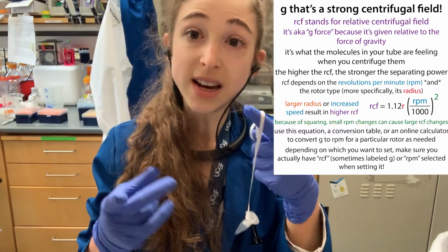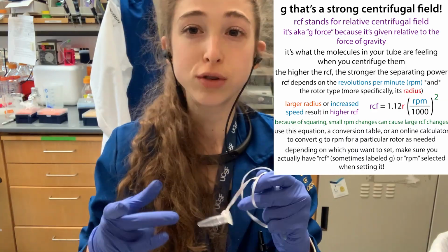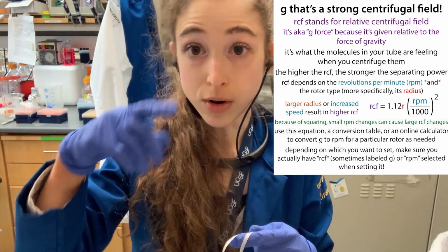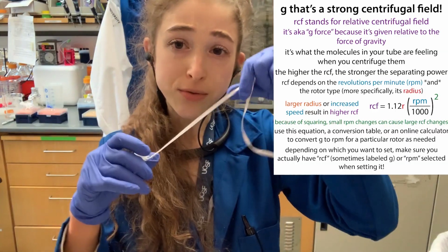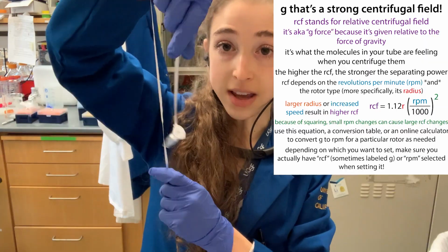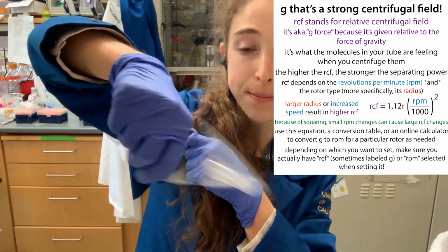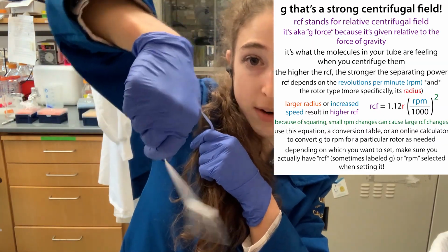We have to decide things when we're centrifuging, like how much force we want applied. How much force is going to be dictated by how fast the rotor is spinning, the part that spins, and also how far the tube is from the center. So if you think about a tube and you start spinning it, there's going to be a force applied at the end. If I start spinning faster, that force is going to be greater.